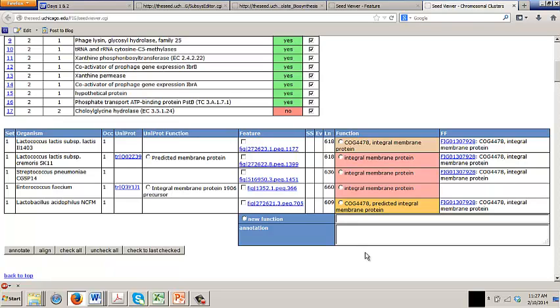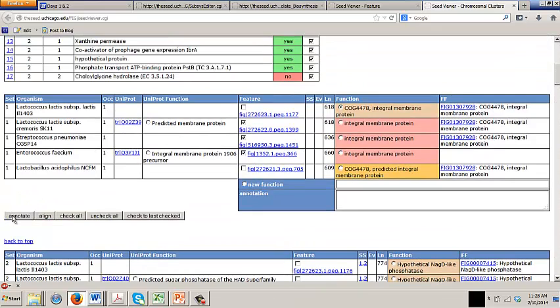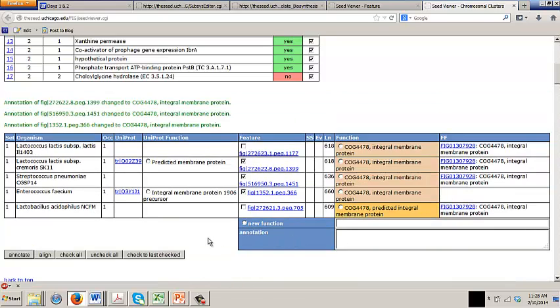and checking these boxes. So always in transferring annotations with the different tools, it's always from the round radio button to the square box. You could even write that down in your notebook because that's a golden rule. There are no exceptions to that. That's the direction in which it goes. It goes from the round radio button to the square box that you check. And now we hit annotate, and in just a second or two it will reannotate the lot. They've now gone all the same colours.